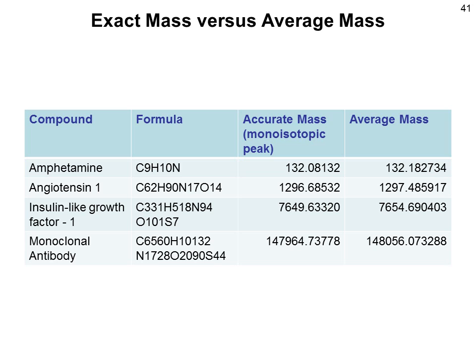To identify molecules by high-resolution mass spectrometry, we have to work with the exact or accurate mass based on the monoisotopic peak. Remember the peak on the leftmost side of the isotopic envelope. The average mass is no good for this, as it deviates significantly from the accurate mass. The average mass averages over all the isotopic peaks.